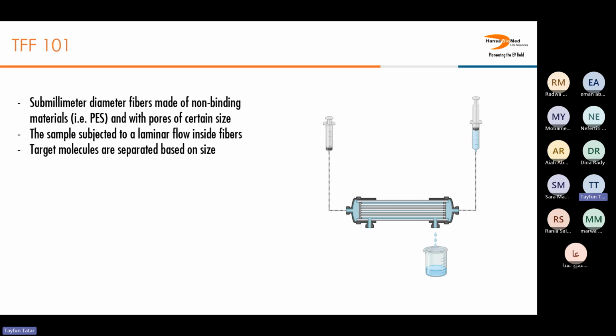But this pore size can be 200 nanometer as well, apart from 50 nanometer. And in this case, what you collect from the filtrate port might be your sample. So it is not always correct to assume that what is coming out of the filtrate is a waste. It just depends on the application.